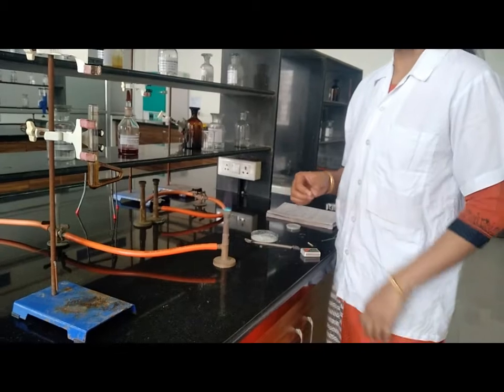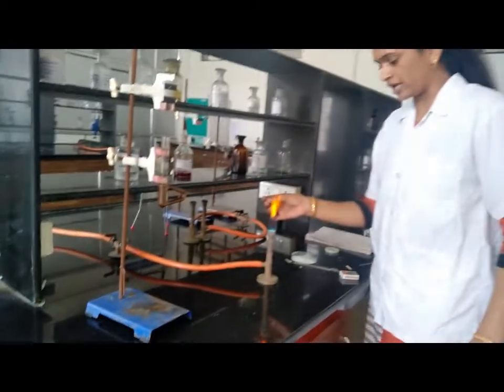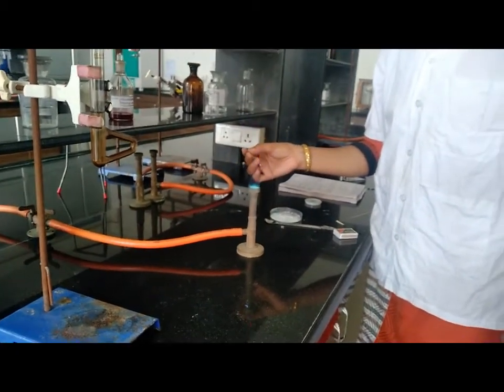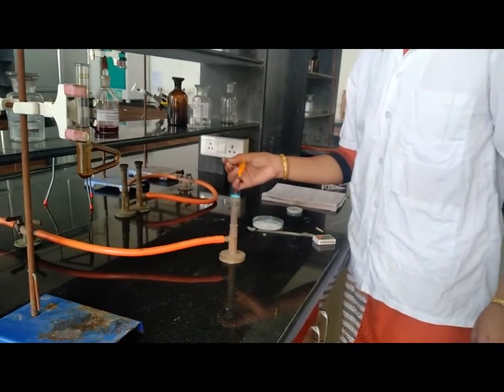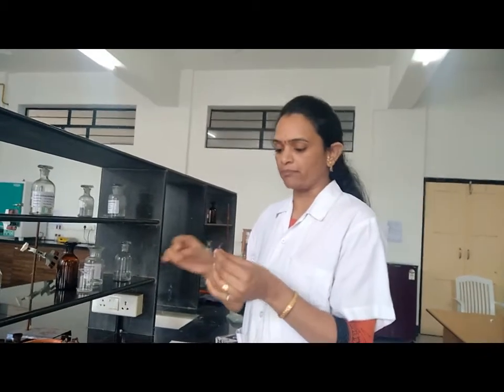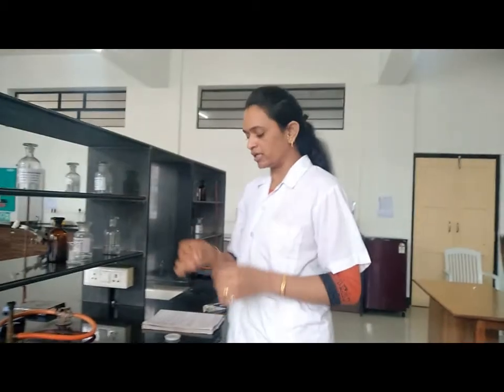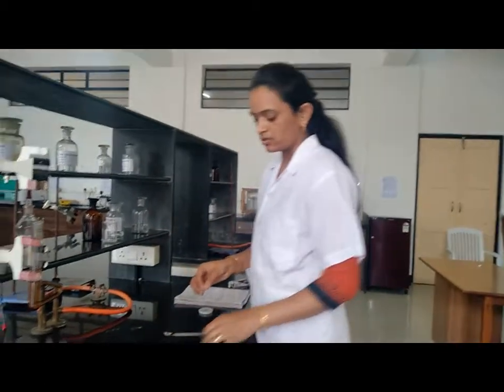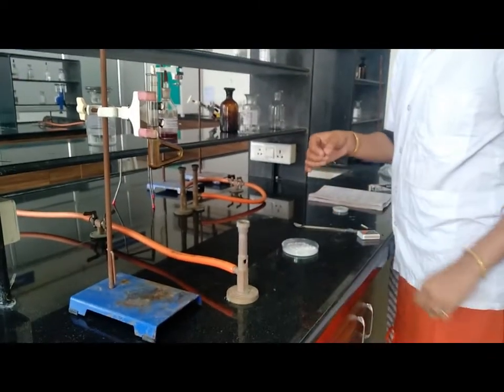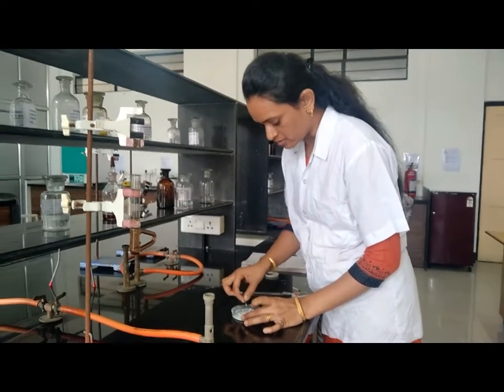Let's start with the procedure. First of all, take a capillary and seal one end on the flame like this. And into this sealed capillary, we have to put the sample for which we have to determine the melting point. This is our sample, an organic solid compound, and we have to put the sample in this capillary.